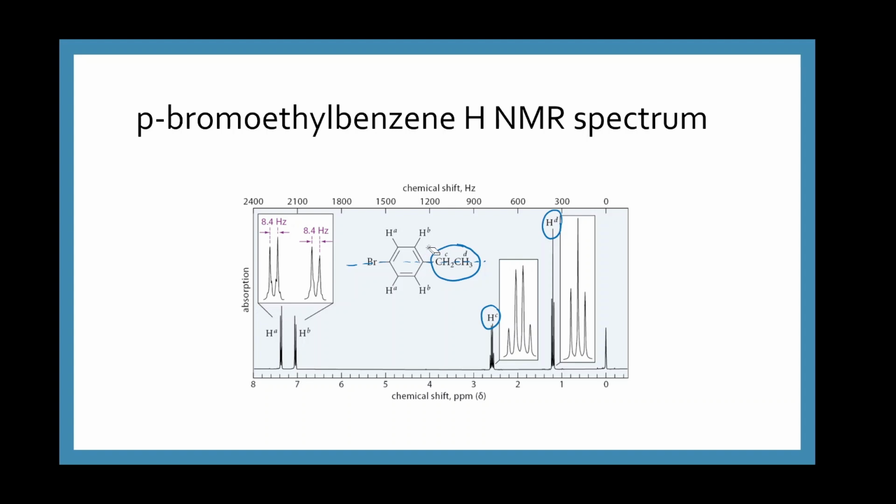Now this peak is a reference peak for 0, so usually something is added that has a chemical shift of 0, and that provides reference information, so you know that all other chemical shifts are higher than 0 for a molecule. So I'll label this as a reference peak.